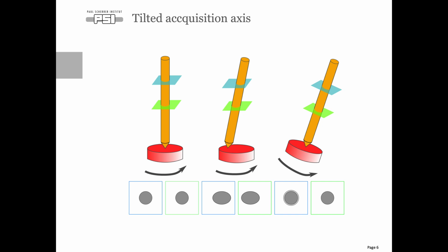You try to rotate the camera to get as parallel as possible. With these measures, you can usually land below sub-degree accuracy. But there is usually still a little bit of error in it, say 0.1, 0.2 degrees.